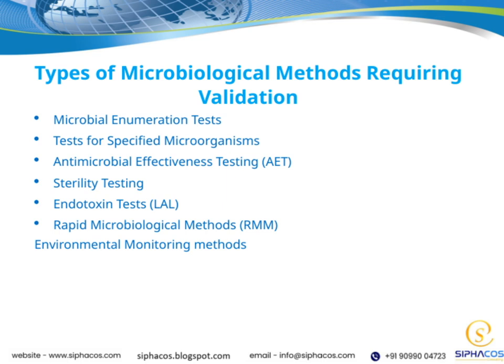Then we have endotoxin tests, such as the LAL test, which are vital for detecting bacterial endotoxins, especially in injectable products. Rapid microbiological methods, or RMM, are gaining importance because they offer faster results compared to traditional tests, helping us make quicker decisions. Environmental monitoring methods keep a close eye on the manufacturing environment, ensuring that conditions remain within acceptable microbial limits.